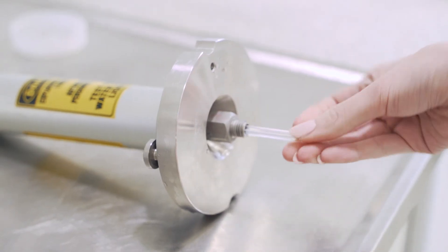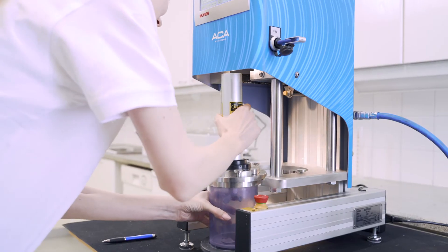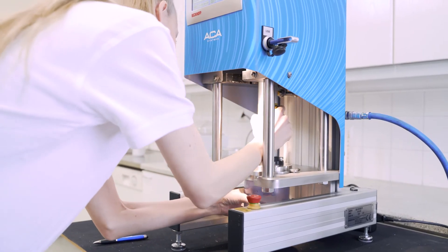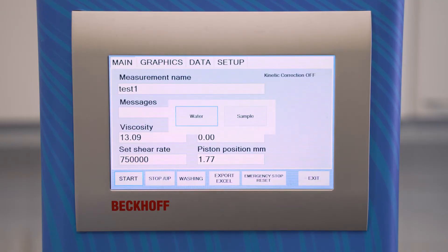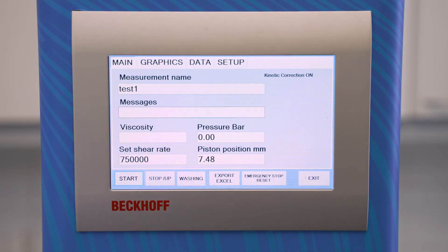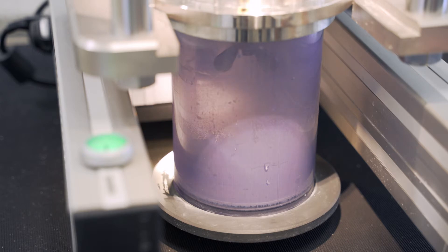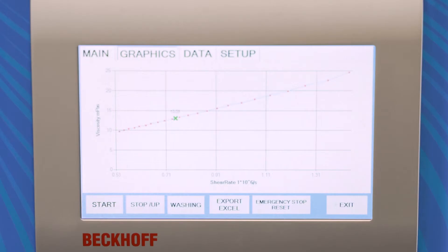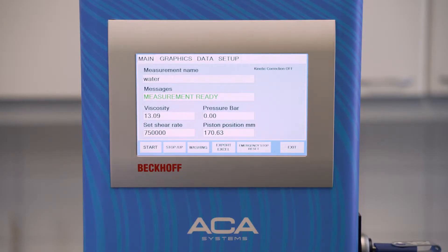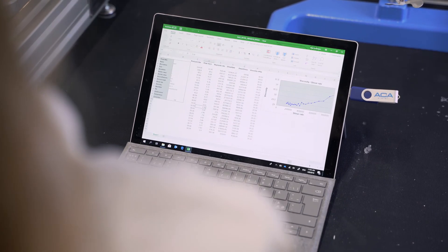The measurement principle is to measure flow rate through the capillary. First, high pressure is reached via a pneumatically actuated cylinder. Then, the cylinder pushes the piston inside the measurement cylinder and causes the flow through the capillary. Pressure and flow values are recorded and AX software gives viscosity and shear rate results on a touch PC screen. The results can be driven out via an ethernet connection or can be saved on a memory stick.